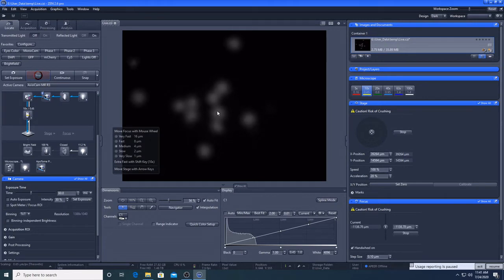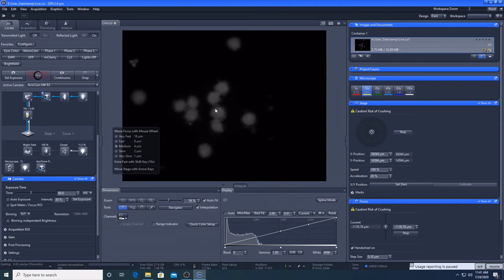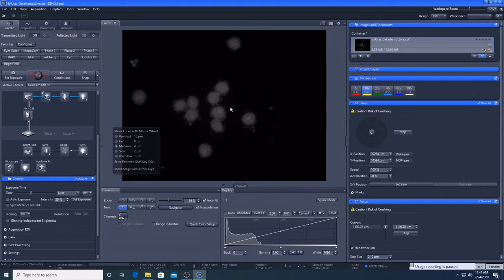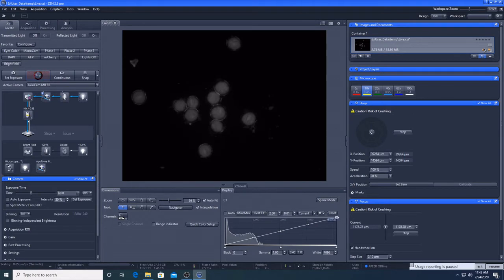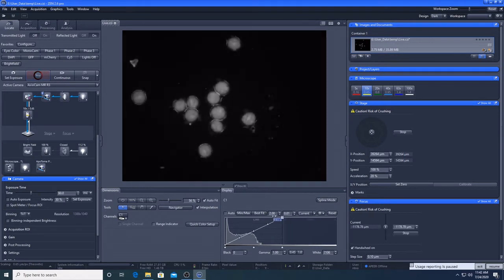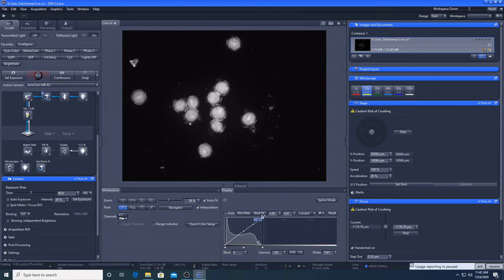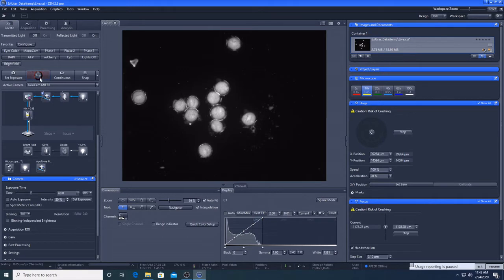The speed of the focus adjustments can be changed using the menu. If you want to increase the contrast of the image without increasing the exposure time to avoid bleaching, I can change the way the image is displayed using this histogram. I will go into more detail about this histogram later in the video. I will now press stop and switch the reflected light off.